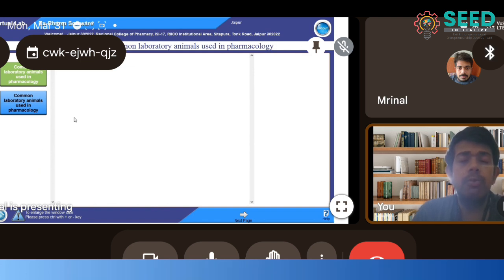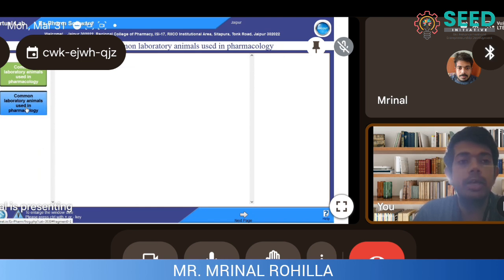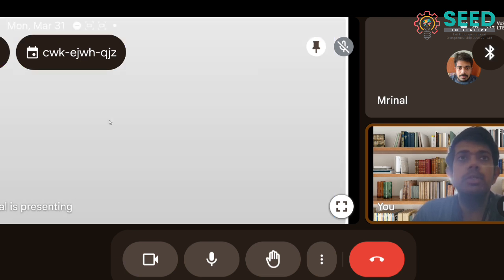So why do we learn these animals? Different animals are used in the laboratory for in vitro and in vivo experimentation. Without wasting time, we'll list the animals. So here are the animals.